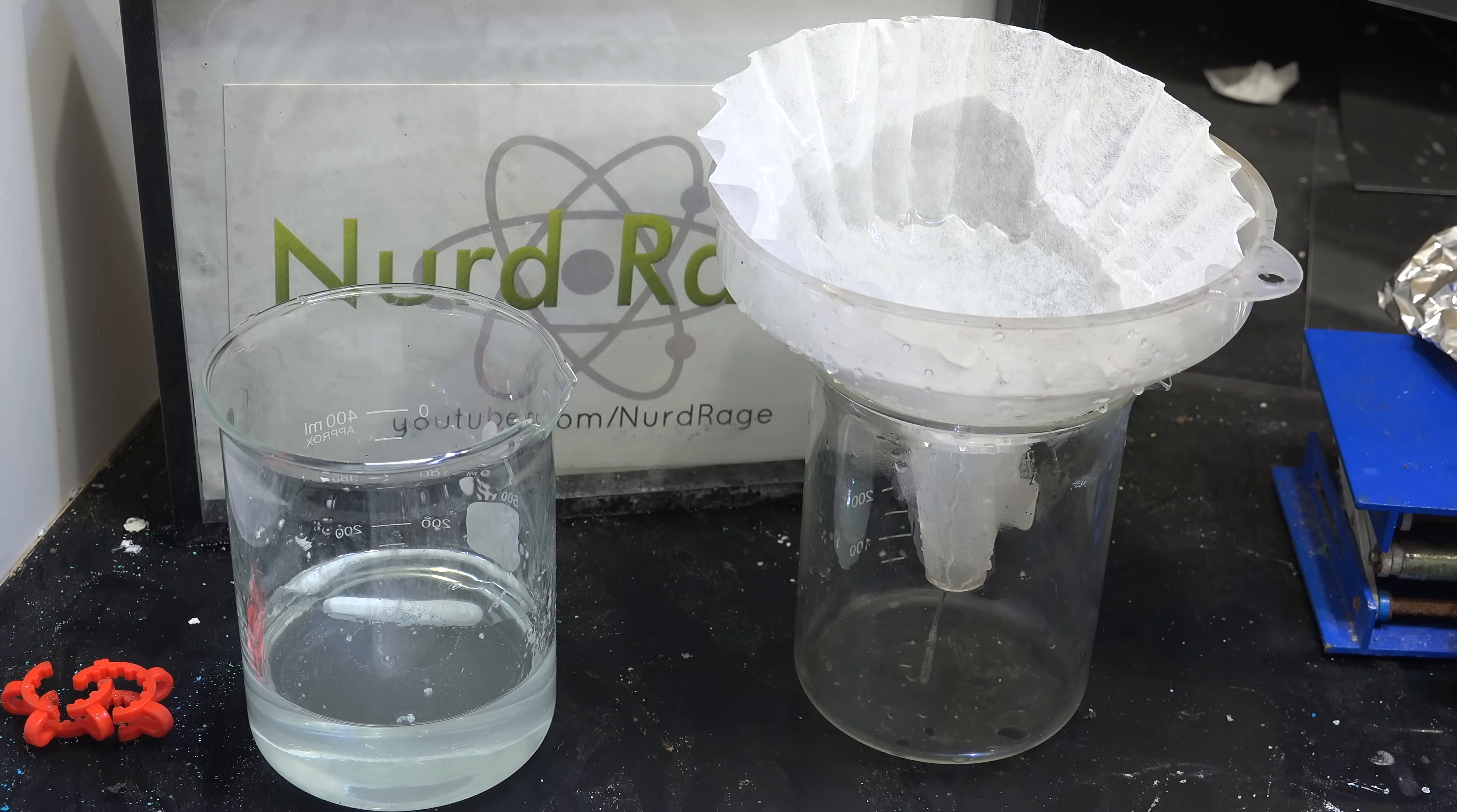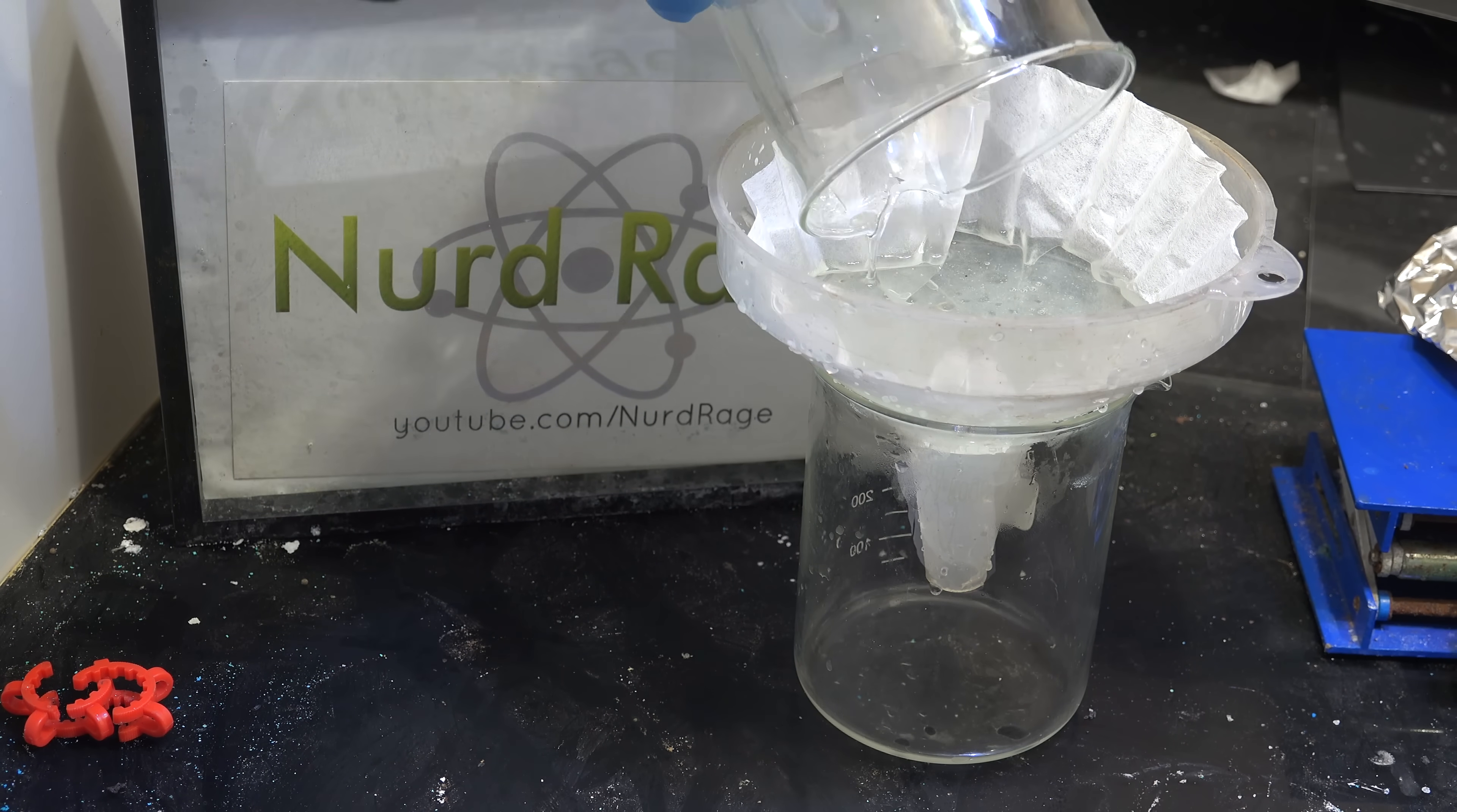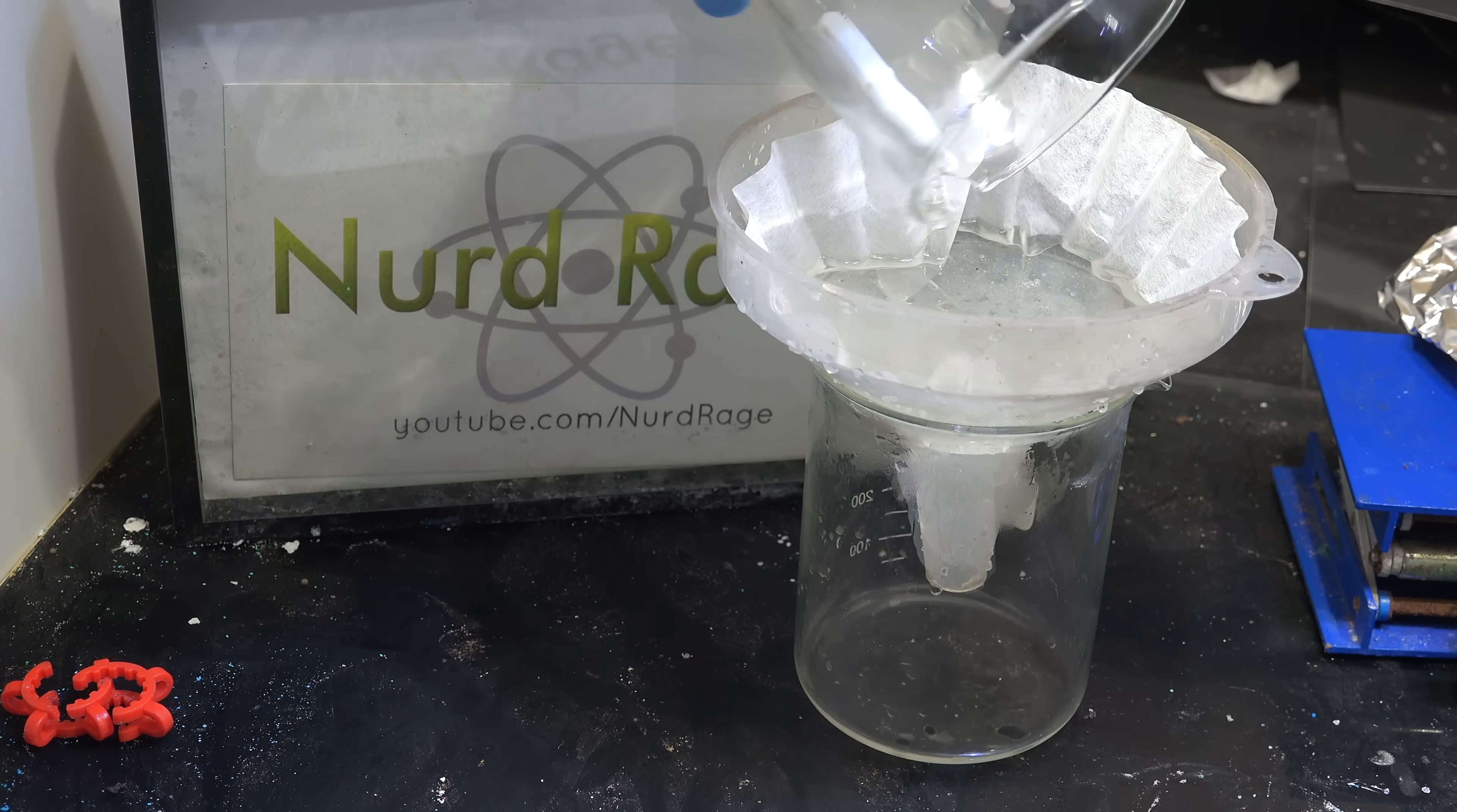The silica gel in cat litter might not be all that pure, so I recommend filtering to remove any insoluble particles. This should be done while the solution is still hot.